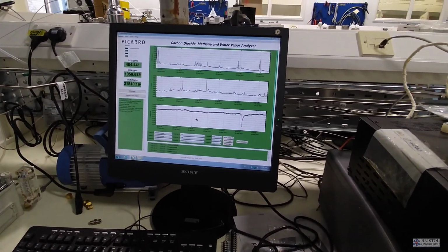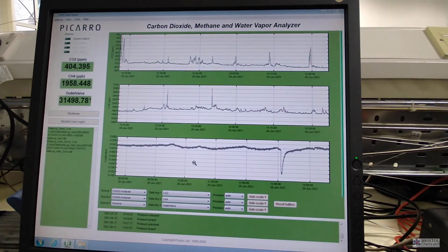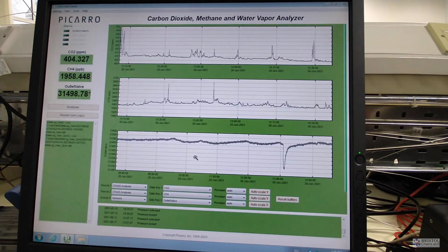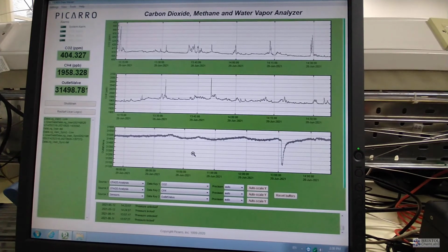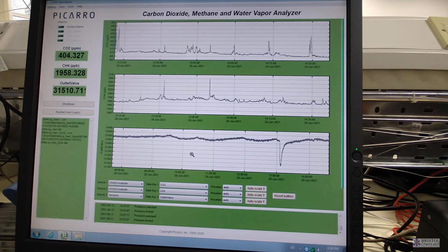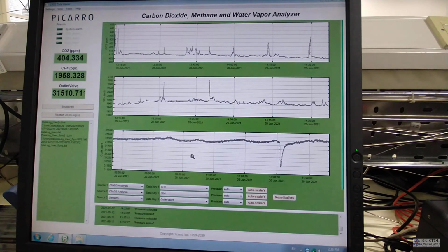Some of the equipment that we have, like this optical laser instrument here, is bought directly from companies. Typically they can measure about 2 to 3 different compounds at once. We use this one specifically to measure carbon dioxide and methane concentration, and something like this costs about £80,000. It measures concentrations in the parts per billion range, so it can detect about 1 molecule of carbon dioxide in 1 billion molecules of air. That is about the equivalent of a drop of water in a swimming pool.